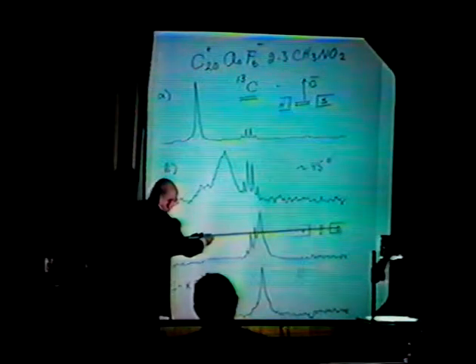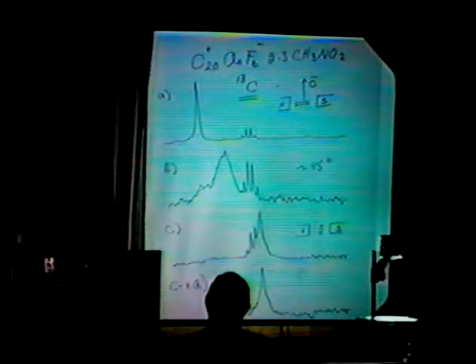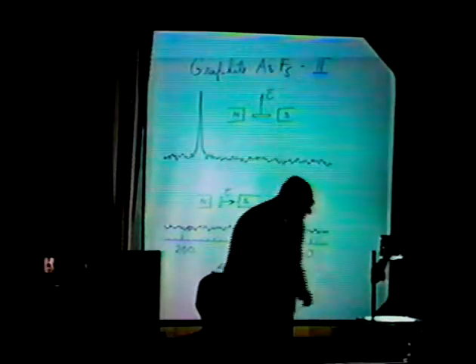This is anyway. You can see that the two extreme orientations are very narrow. We have a broad line in the middle, and this is because we have a distribution of orientation to the plane. So this is one kind of imperfection you can have, a distribution of orientation.